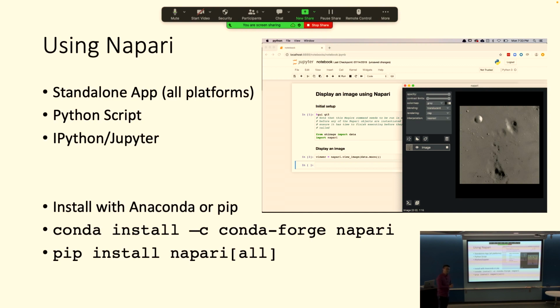Yeah, Camilo. What's the minimum Python version in order to run it? That is a good question. I think the more popular, more recent Python versions it will support. So I tested it on Python 3.7, 8, 9. It all works. I'm not sure about earlier versions as well. So, all right, great question. Any other questions?